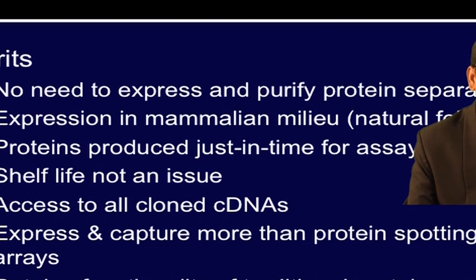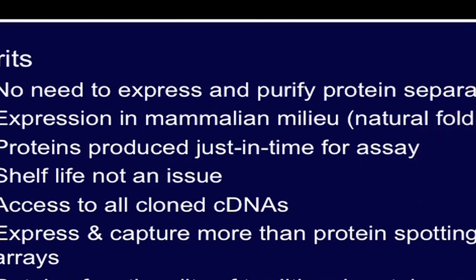Comparison of protein synthesis from NAPPA chemistry with traditional protein purified arrays have demonstrated that expression and capture can be achieved more by using NAPPA chemistry. The NAPPA approach retains all the functionality which one can use for traditional protein arrays, and adding strength to the system, storage of protein arrays printed using NAPPA chemistry at room temperature is one of the major advantages of this chemistry.